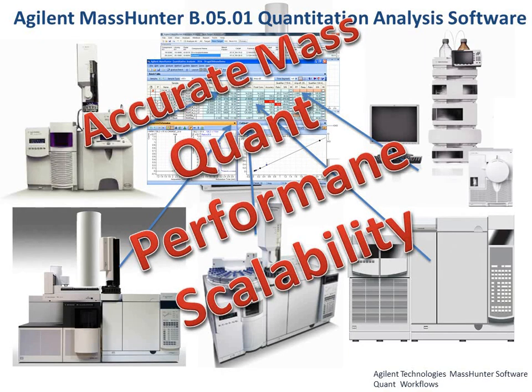Welcome to an interesting discussion of accurate mass quant performance scalability. As an intro here, we need to make some assumptions. First, I'll assume that you're involved in target screening, one target ion, and also interested in the match score to build confidence that that is the right target. And I'll also assume that you are analyzing results from one instrument on one shift.